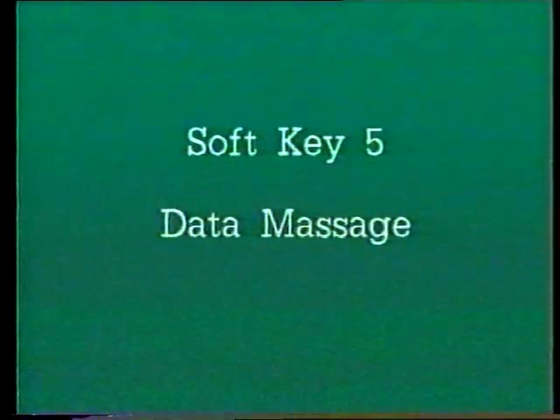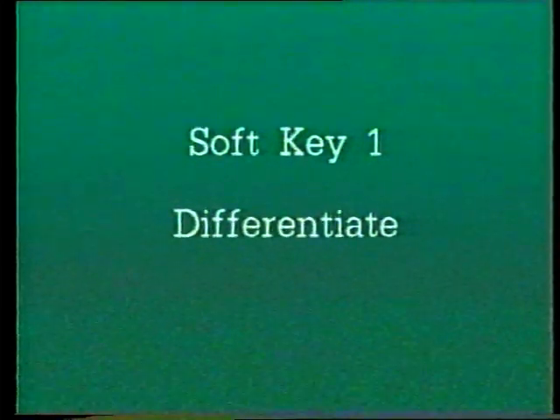Data massage, soft key number 5. Differentiate, soft key number 1.